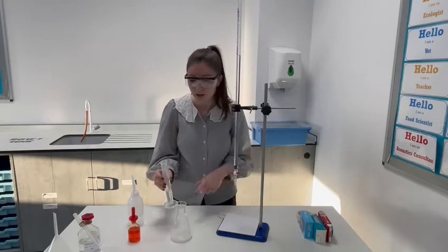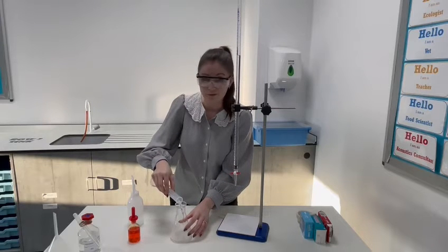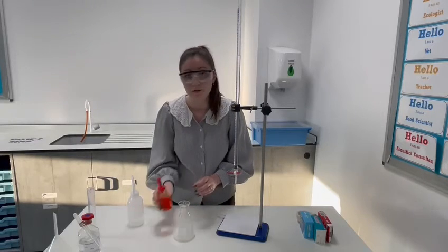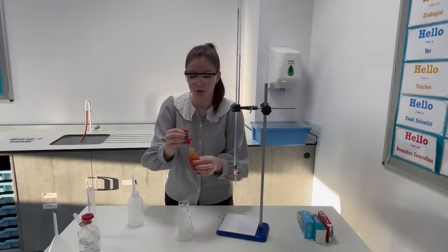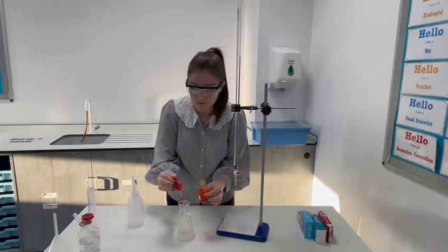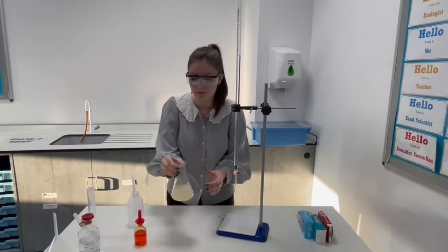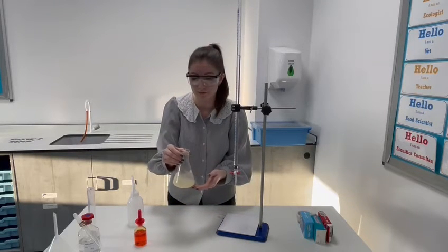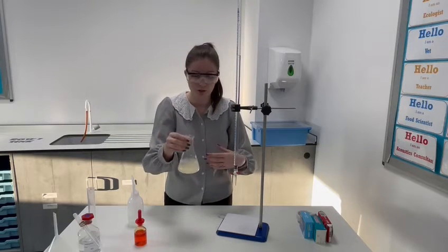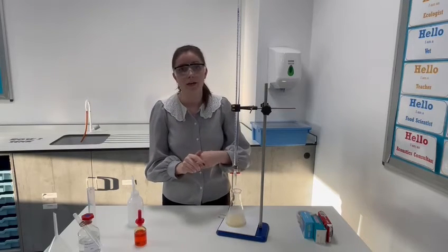And then to that flask I'm going to add 25 centimetres cubed roughly of deionized water, which I pre-measured, and then I'm going to add 3 drops of methyl orange. You could use something like phenolphthalein. These are indicators that students should be familiar with at GCSE, but it's also okay if they're not yet. We can just discuss the colour change beforehand. So methyl orange at the moment is yellow. In my burette I have my hydrochloric acid.